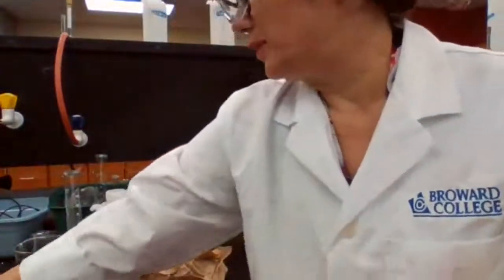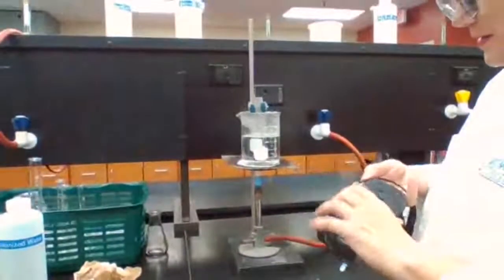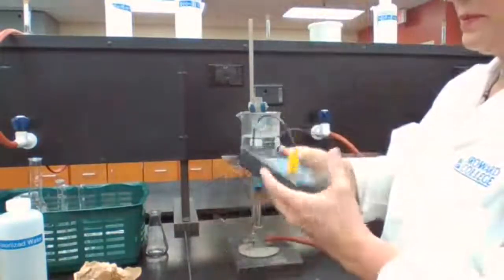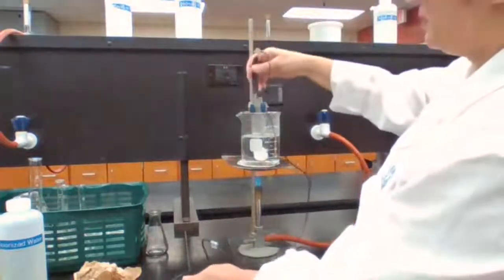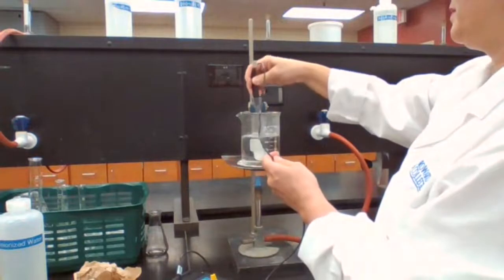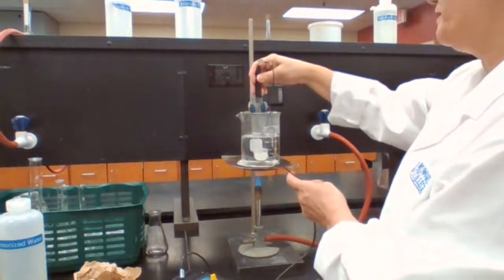We heat it up until it is completely melted. We can use the digital thermometer here. The digital thermometer measures the temperature of the benzophenone.